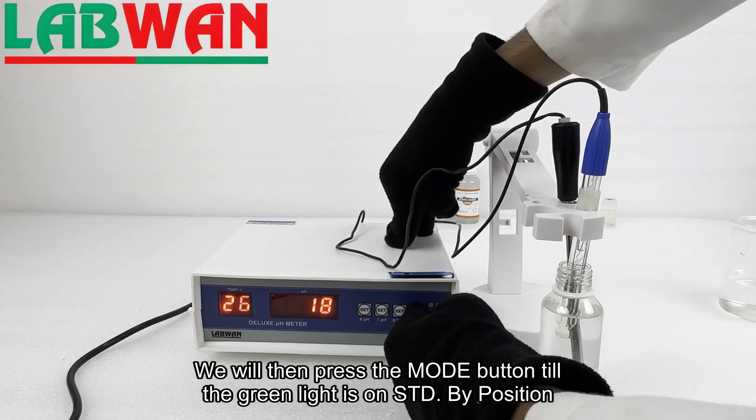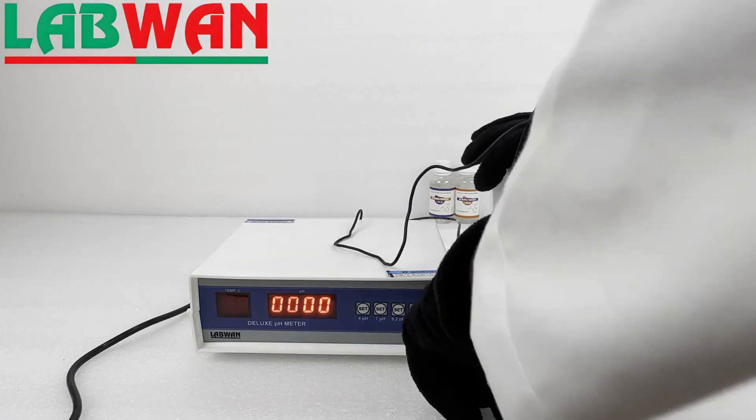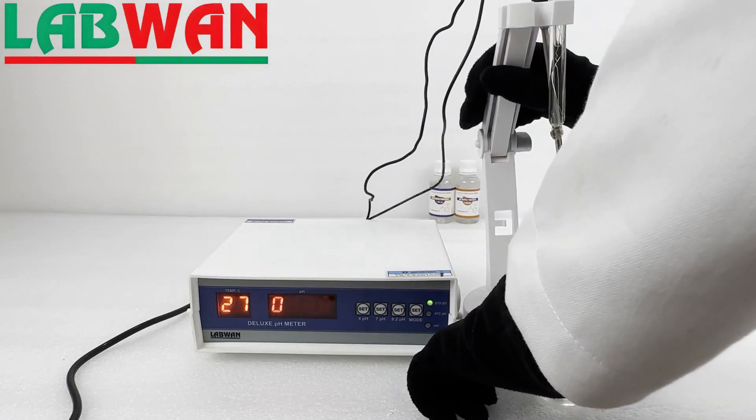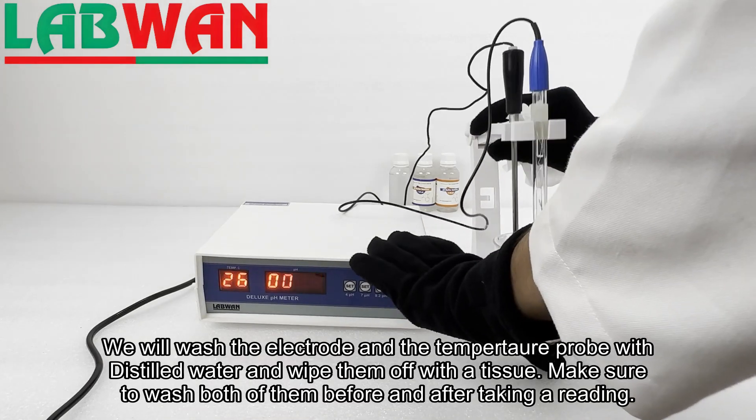We will then press the mode button until the green light is on the STD by position. We will wash the electrode and the temperature probe with distilled water and wipe them off with a tissue. Make sure to wash both of them before and after taking a reading.